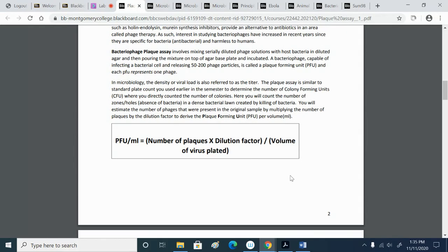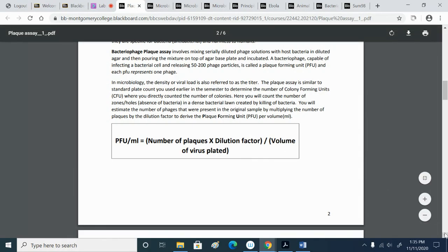But like I said, I normally include the volume on the plate as an exponent and then factor that into the dilution. And then we get the final dilution factor, which includes everything. But you can wait to the end and simply divide by the volume you put on the plate. So either way, it's the exact same result.